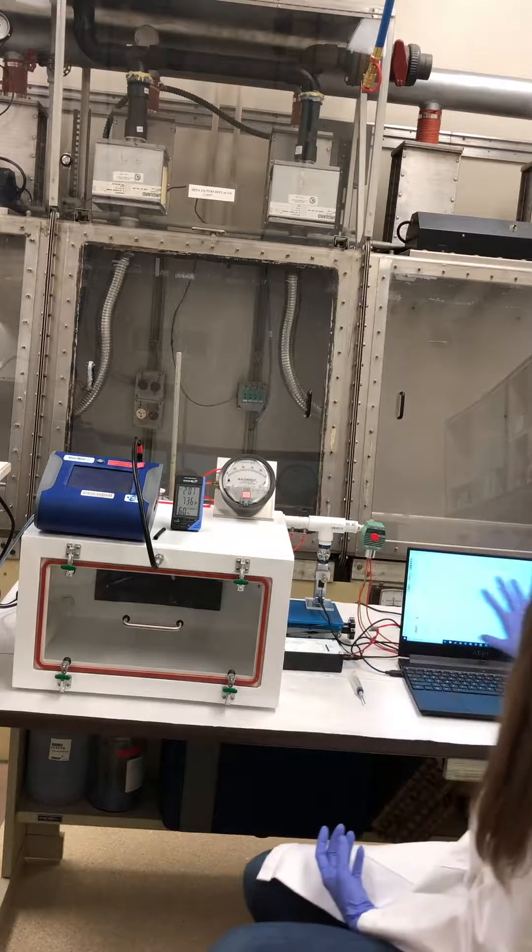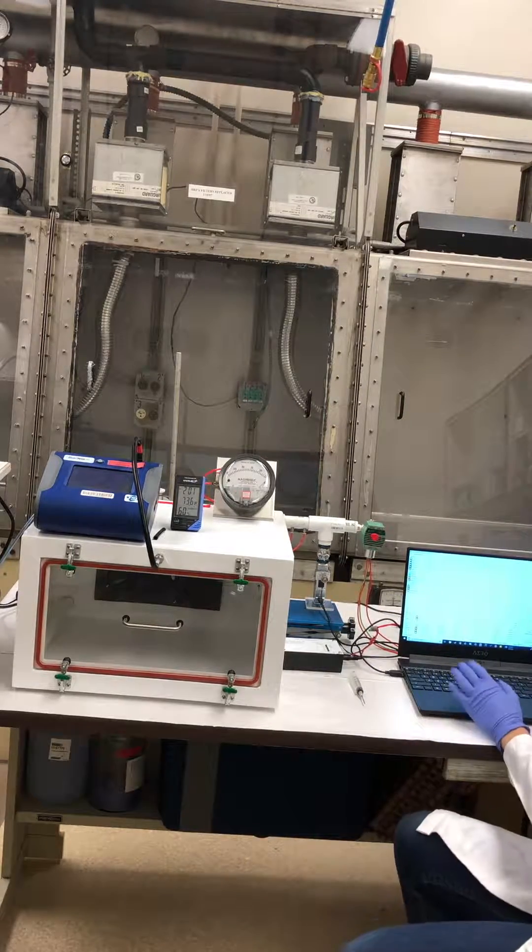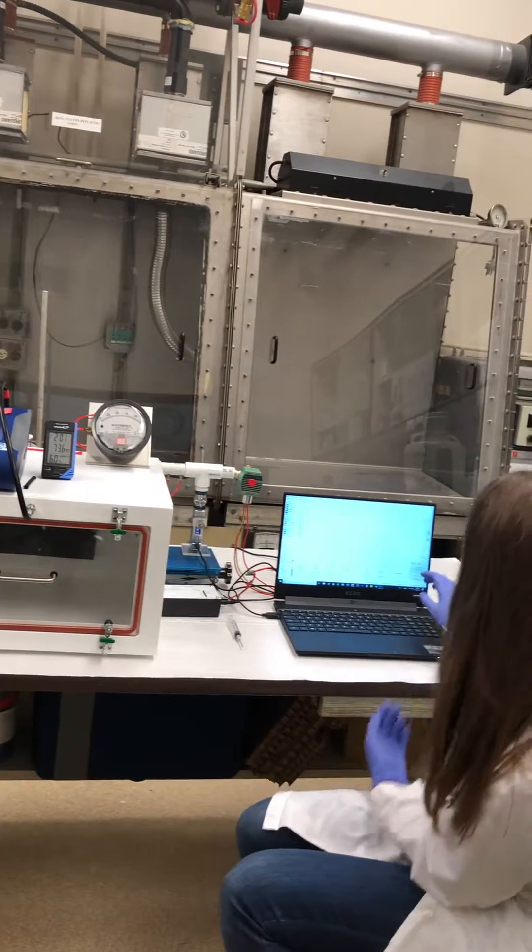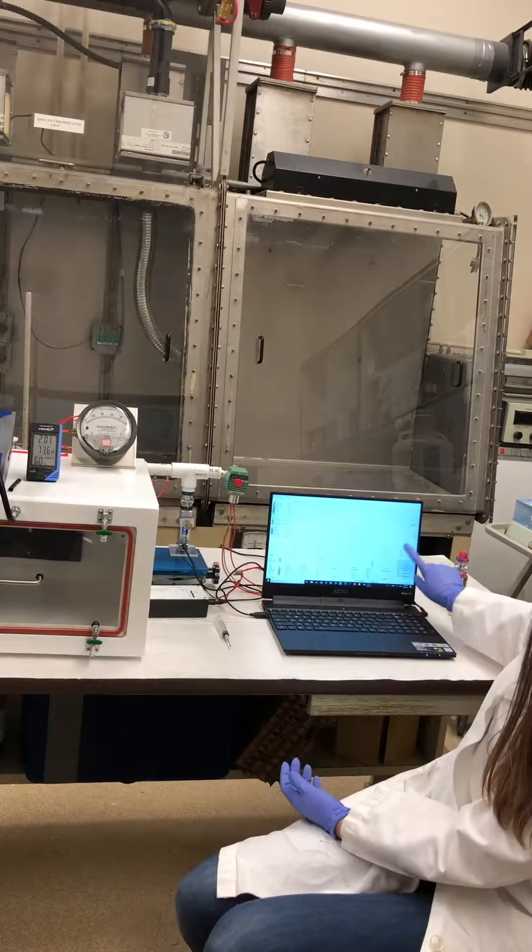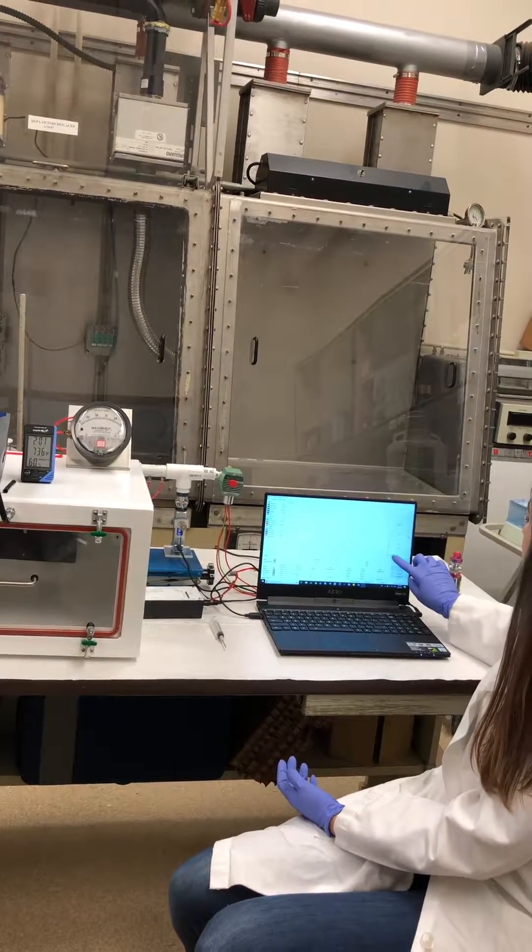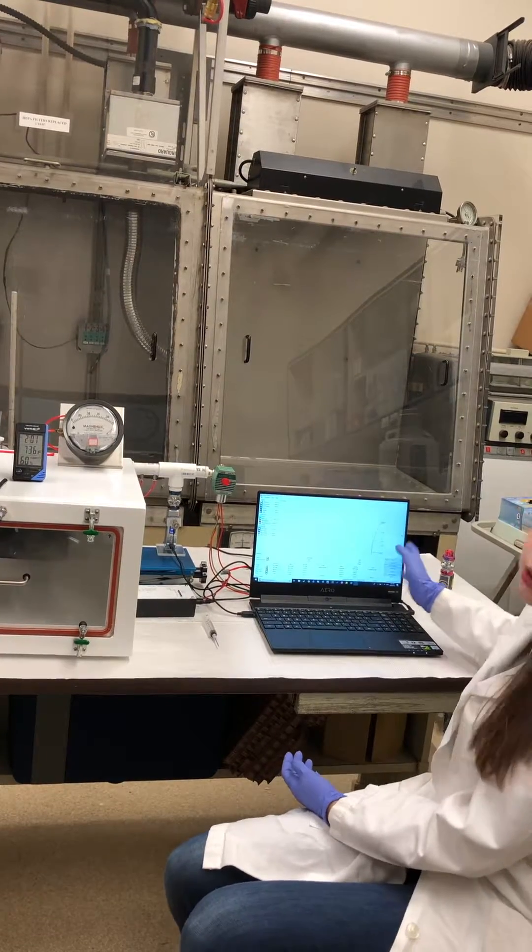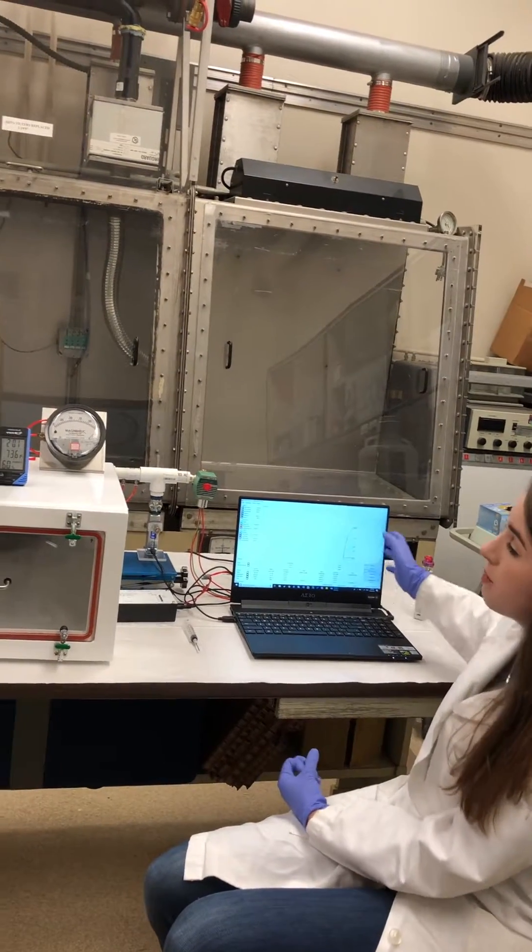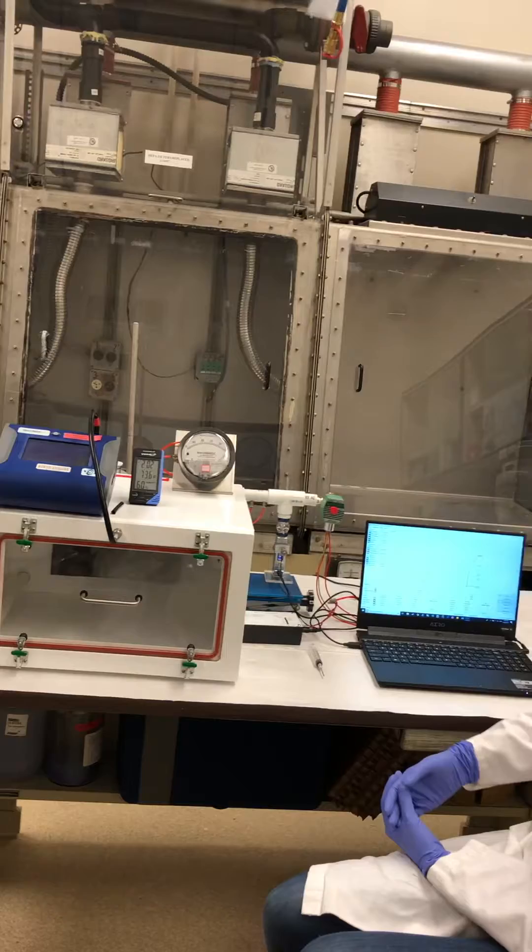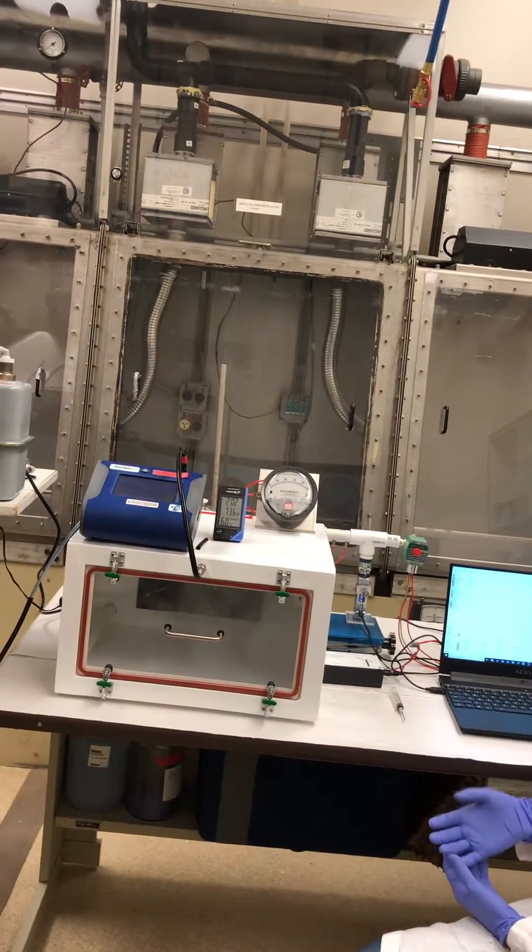And then we also can monitor the puff, the temperature, the power, the current and the voltage in real time, and see exactly what's happening at a per puff level, so that we have that information for when we go back and do our studies and expose different models.